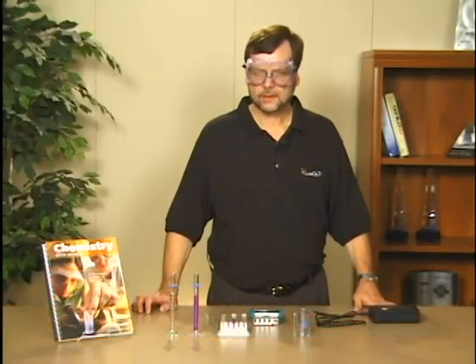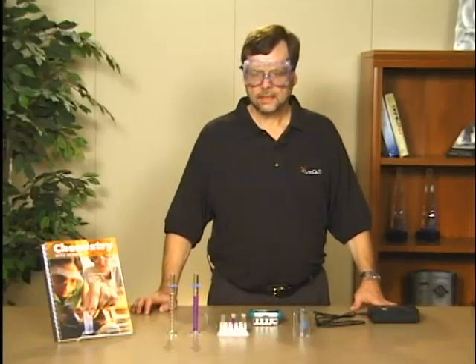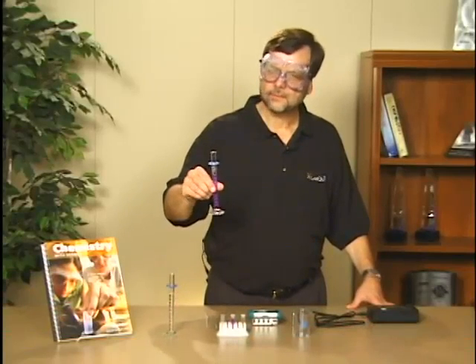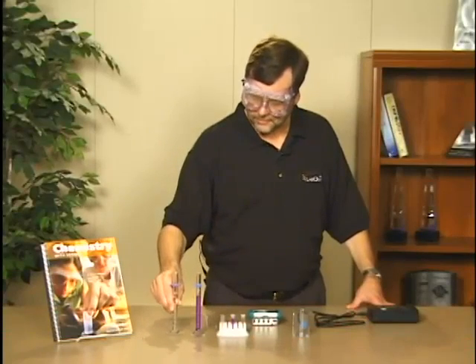Today we're going to do experiment number 30 from the Chemistry with Vernier lab book. This experiment is the rate law determination of the crystal-violet reaction. It involves an investigation of the kinetics of the reaction between 2.5 × 10⁻⁵ molar crystal-violet solution and 10 mLs of 0.1 molar sodium hydroxide.